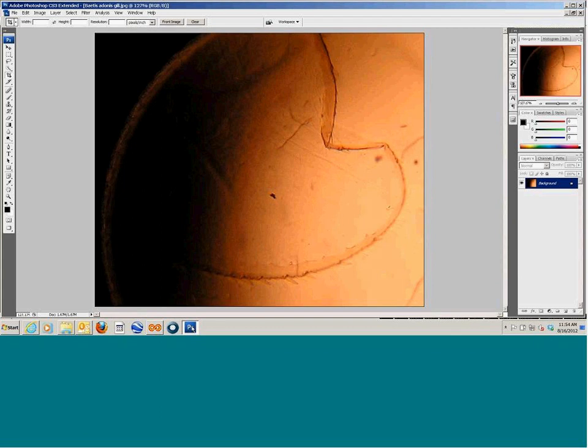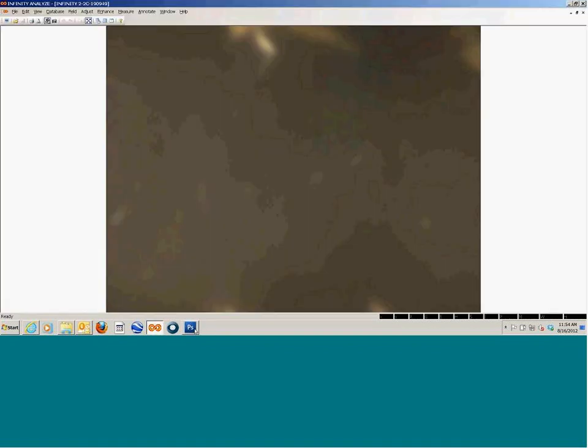Can you see this now? This big blow-up picture of the adonis gill. Can you see that? Yeah, all right, it's on yours. You can see a better view here, and I blew it up in Photoshop here of the spines. I just wanted to show folks that real quick before we go into the specimens.